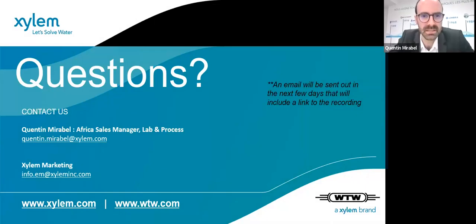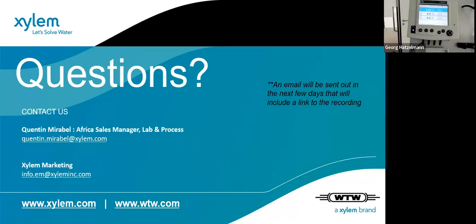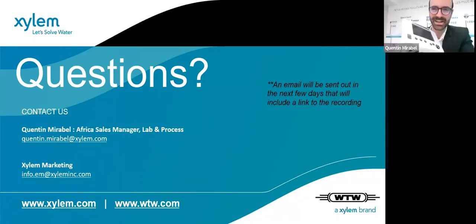If a client can't afford a sensor net, do you have a USB port to collect the data? Of course. I have a transmitter with some modules.